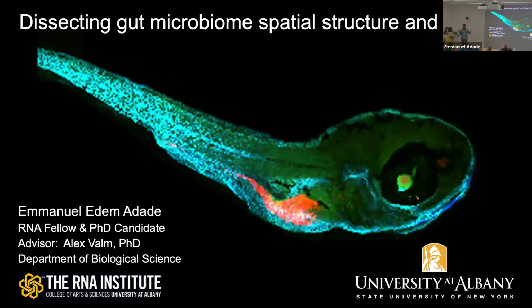And these can influence various aspects of development, right? The factors that shape the composition of these microbes and how they are established along the gut have not been fully mapped, even though we have ideas of what microbial diversity might exist within those structures. But really having this tool to be able to visualize the native microbiome in its native ecological state allows us to start teasing apart essential microbe interactions that drive specific host responses, and to visualize how these would give us insight into understanding host-microbe interaction and host-microbe dynamics.